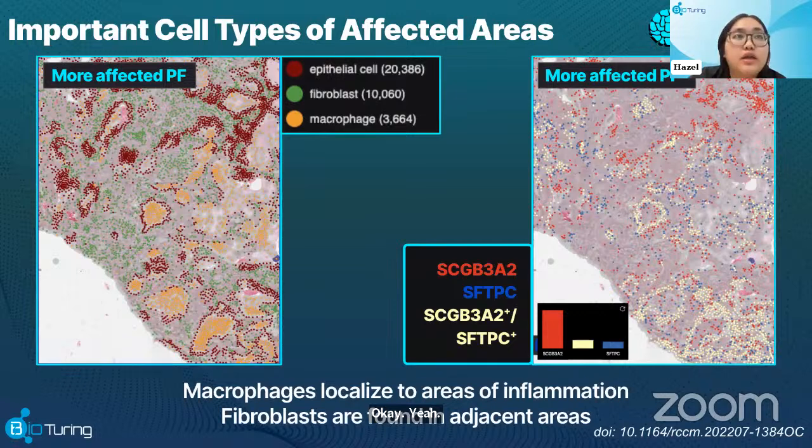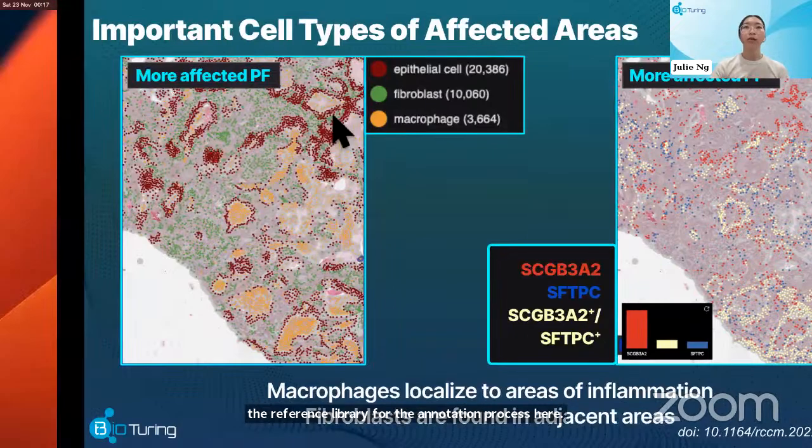I'm sorry, I already got lost here. Because you also mentioned meta-reference here, during the annotation process, have you used any customized reference, or did you use the whole reference library for the annotation process here? Yeah, so let's switch back to SpatialX.